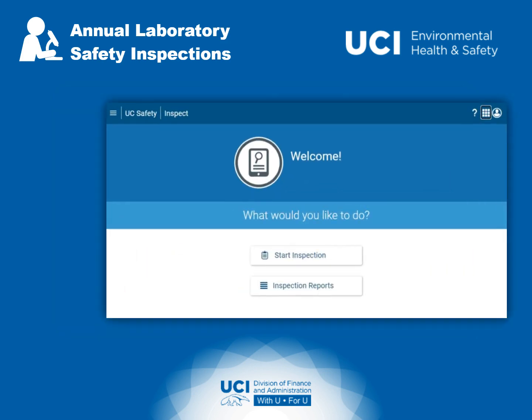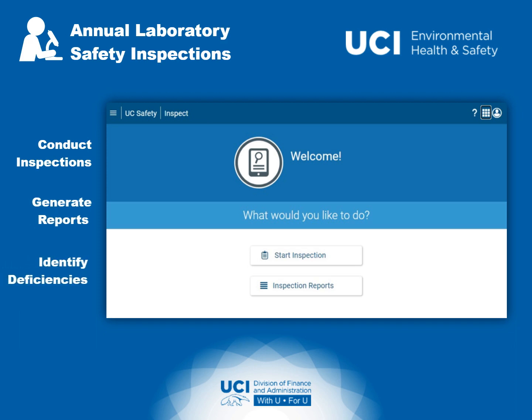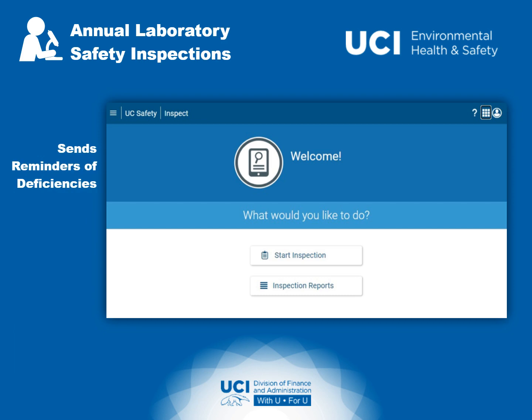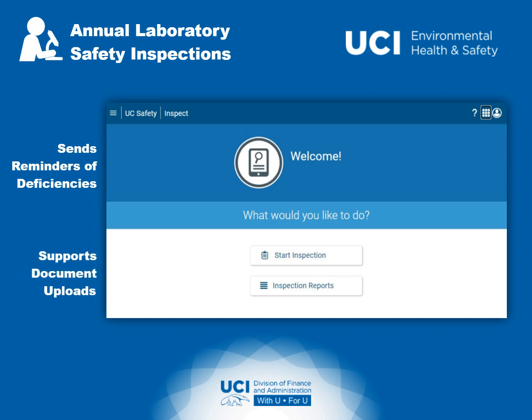EH&S is now using UC Inspect, a new mobile application used to conduct inspections, generate summary reports, and identify deficiencies. The system is designed to automatically send out reminders to the responsible party to correct deficiencies after 30 days have passed, and allow for document uploads to confirm and address deficiencies.